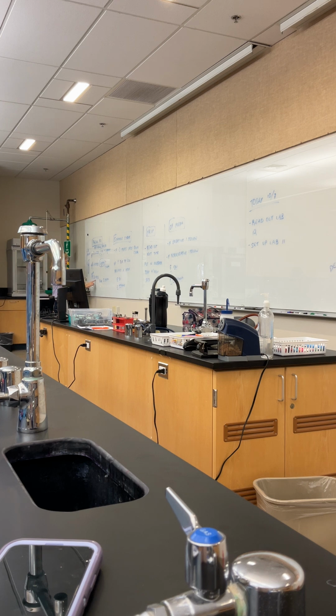We go to the last one, sucrose. I had E. coli and Proteus vulgaris there. We're giving Proteus another chance. Which one of these turned yellow this time? Proteus, good. So Proteus vulgaris is going to be positive.